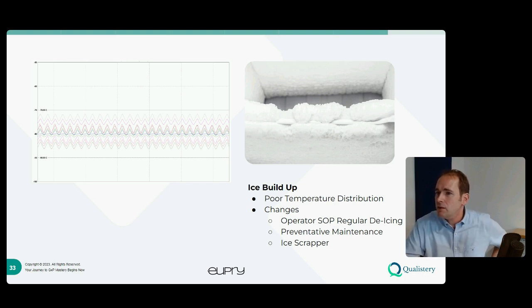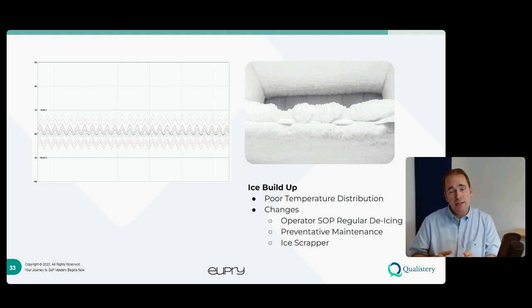Is mapping still needed periodically if the review showed no deviation or changes? Roger, I would say absolutely yes. The thing with the periodic review and the temperature mapping is we cycle them. The periodic review is great. It's going to help us pick up on issues, but it's not going to tell us the whole story.